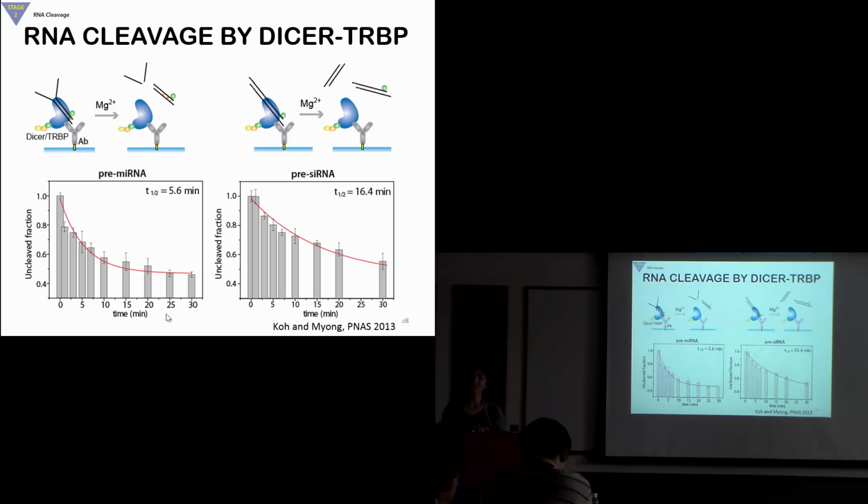So PIFE, can I use this? I'll just be quick. FRET is about 2 to 8 nanometers, and its sensitivity looks like this, right?